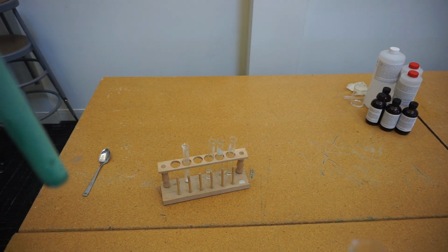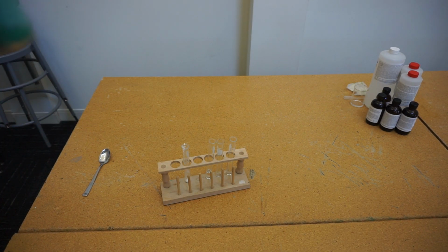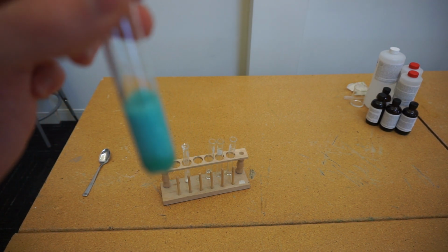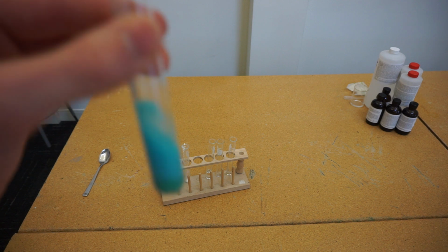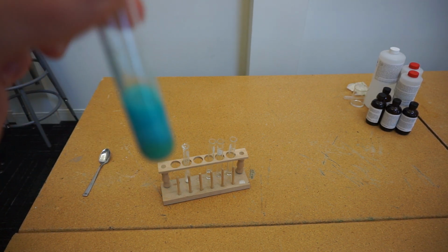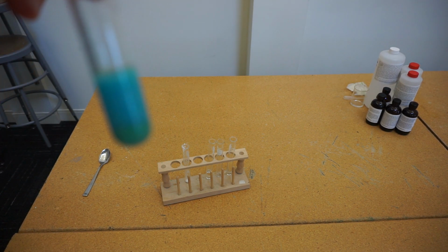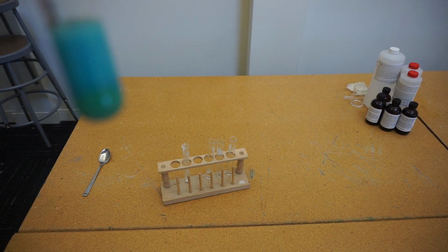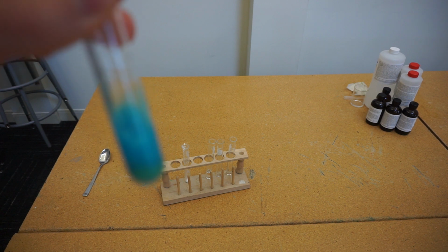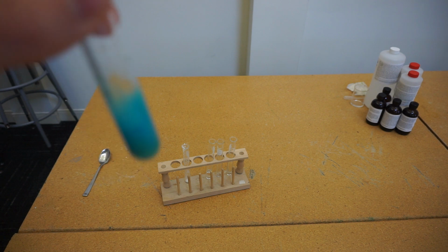sulfuric acid, well, most obvious is actually one of the other telltale signs, a gas being produced. We're seeing there's quite a lot of bubbling going on here, producing quite a lot of CO2 gas from the acid reacting with the carbonate. But once the bubbles clear, our green powder has been replaced with a blue solution, and that blue solution is very characteristic of copper. Most copper solutions will be this quite vivid blue colour.